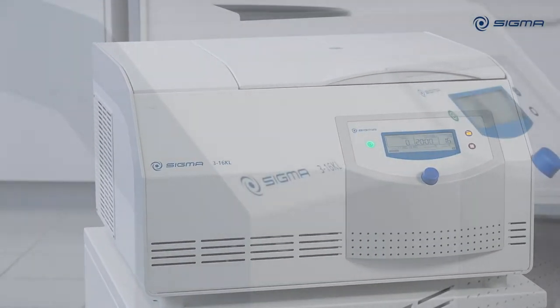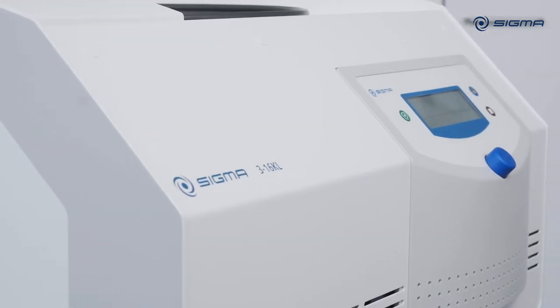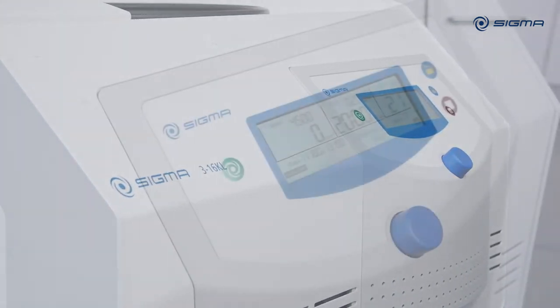Today we are showing you our SpinControl L Centrifuge controller installed in a Sigma 316 KL Laboratory Centrifuge.